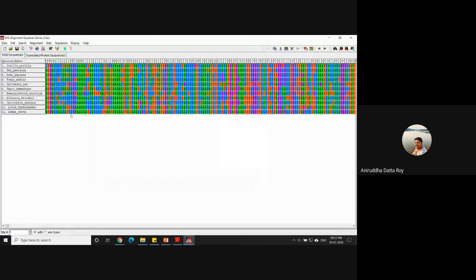And my gene 2, this region is not protein coding, but I have to make sure the way my taxa are arranged is exactly the same as in the previous file. You'll realize why I'm saying this. Both of these you have to align separately. The first file you have to align separately, and this one you have to align separately. You can't align these regions once you concatenate them. So, because this is gene 2, yeah.